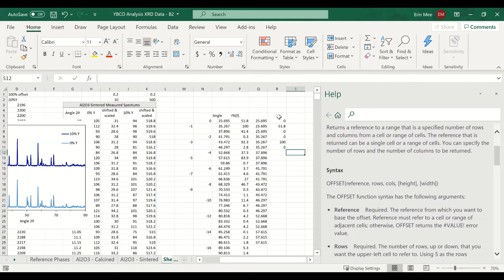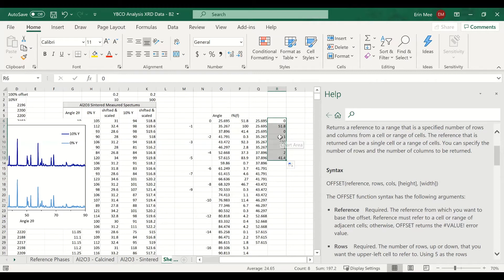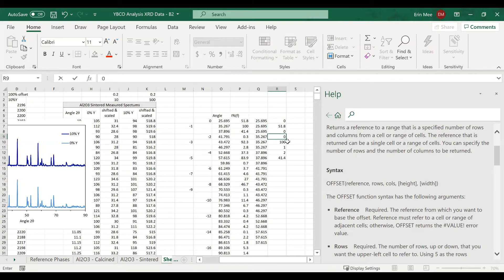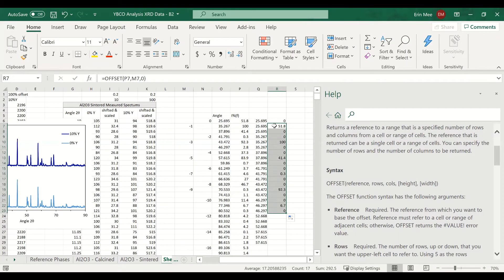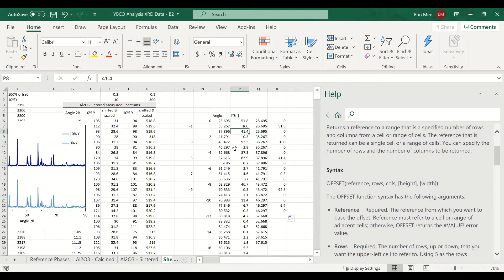One thing when copying down the intensity: ideally you'd grab the single cell and copy it down, but it brings up incorrect values. Instead, grab these three cells together and copy them down. You can see 51, 51, 100, 100, 41, 41 — so yes, that works.